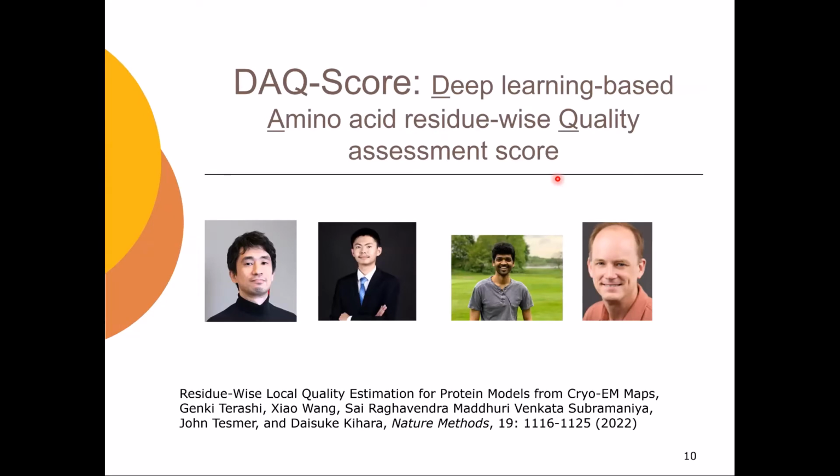Now, okay, so that was the resolution for map resolution of 4 to 10 angstrom. If you now use neural network deep learning for higher resolution maps, you can start to see the amino acid types or C-alpha positions. And here in our recent publication, I think this appeared about a month ago.